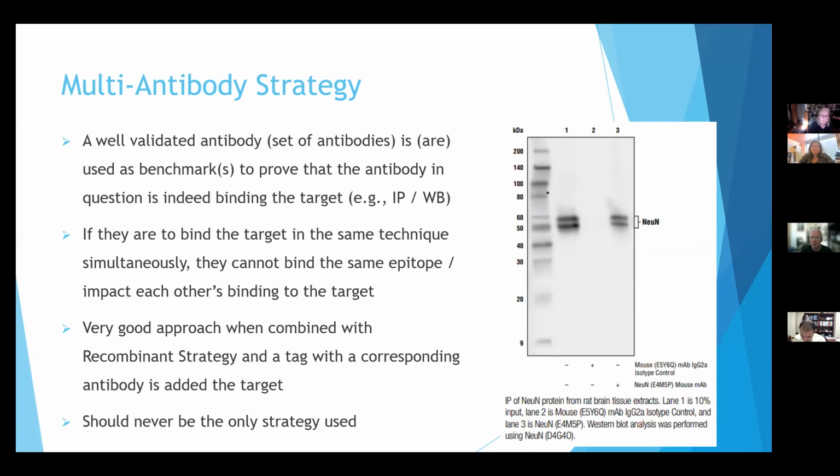And so basically in this particular case, they immunoprecipitated with one of them. I forget whether it's the known or the new one. And then what they did was run it on a gel and do a Western with the other one. And the only way that this would come up positive is if they both bound the target, I forget.